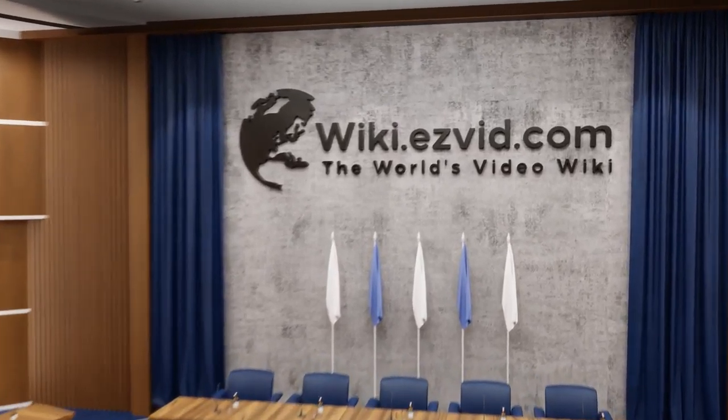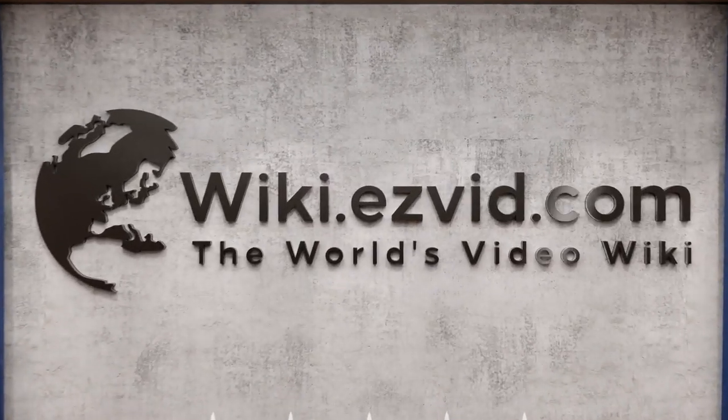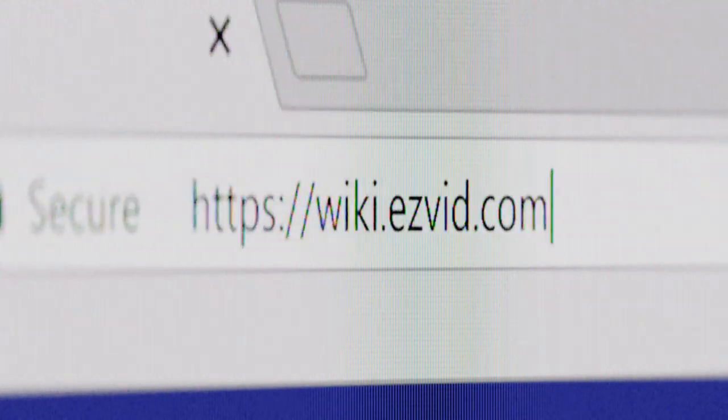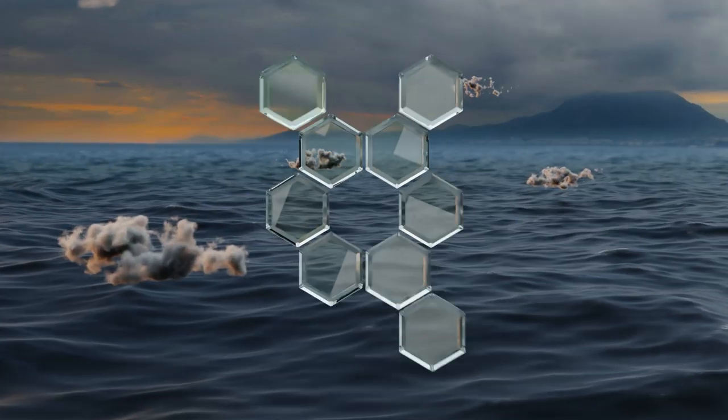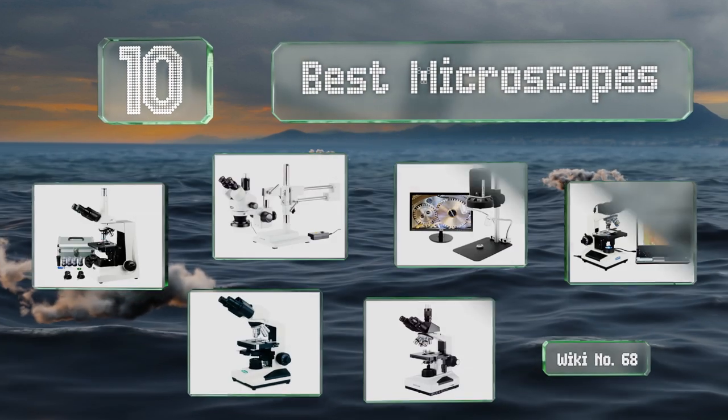EasyVid presents the 10 best microscopes. Let's get started with the list.